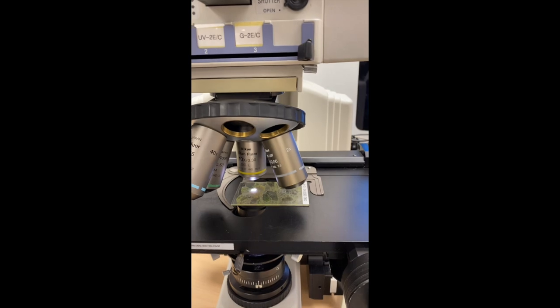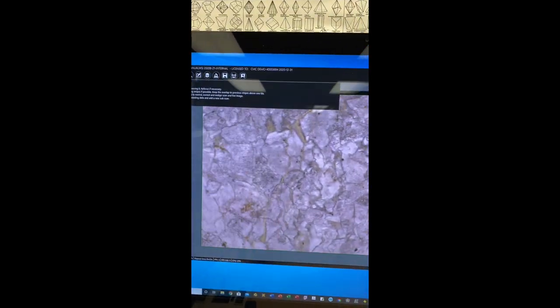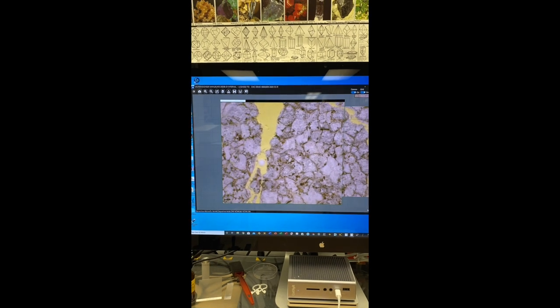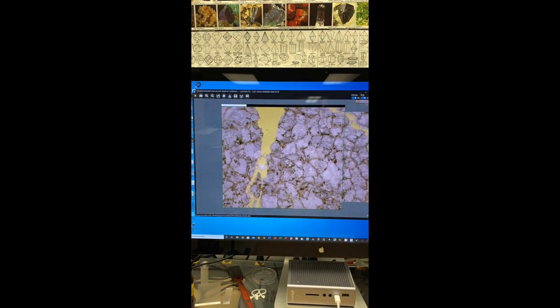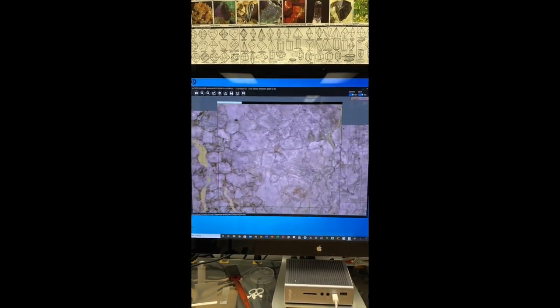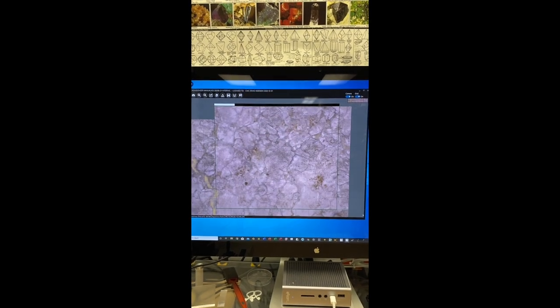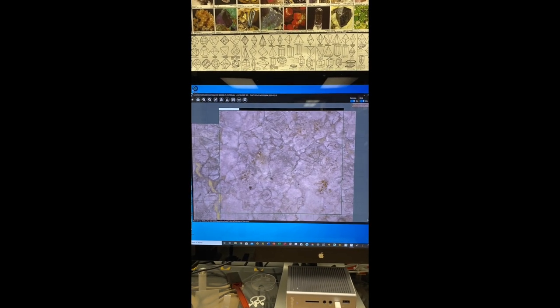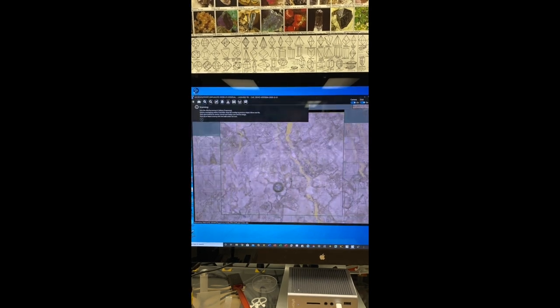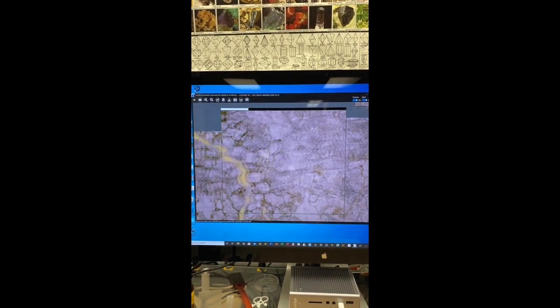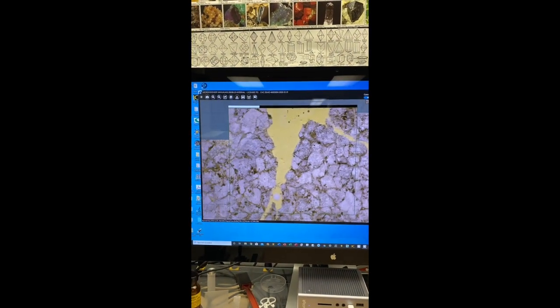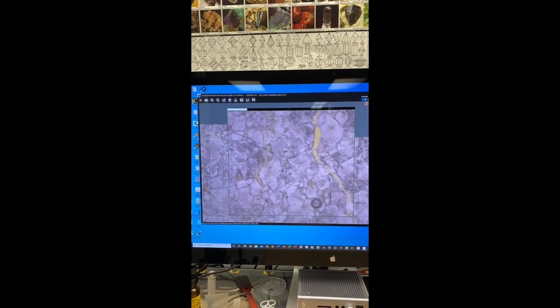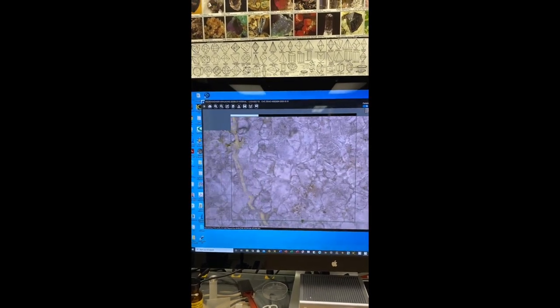portion of the thin section that is selected. After it goes 20 points in the x direction it goes to the next row, that way it will do 20 points along x direction in one row and then 20 rows along y direction.